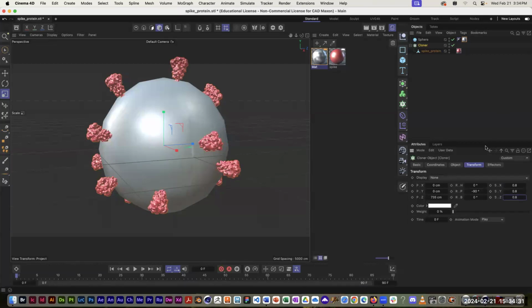Of course, I realize now that I've done that, I've made them all smaller. Now they're sticking a little too far out of the surface, so I'm going to sink them back in to the surface just a little bit. Just about like so. Maybe that looks pretty good.